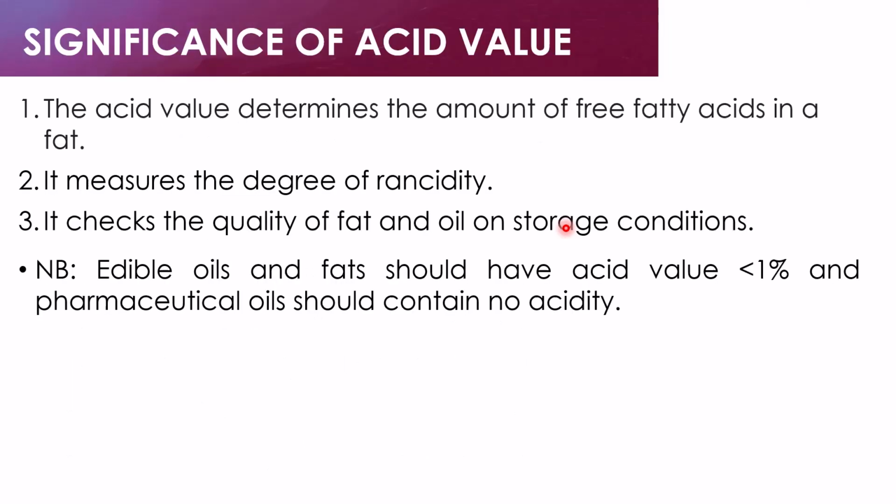Significance of acid value. 1. The acid value determines the amount of free fatty acids in fat. 2. It measures the degree of rancidity. And 3, it checks the quality of fats and oil on storage conditions. And what we also have to note is that edible oils and fats should have an acid value less than 1%, and pharmaceutical oils should contain no acidity.